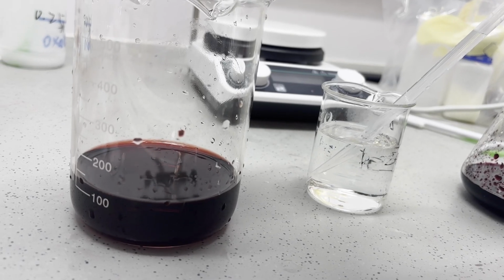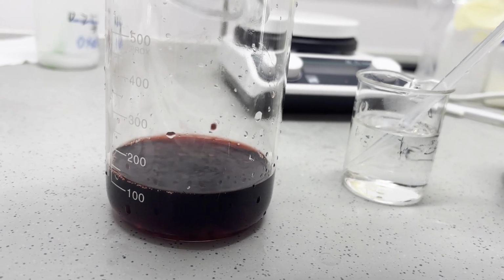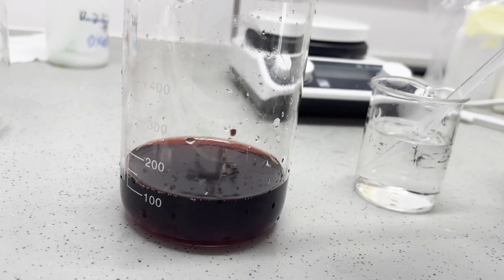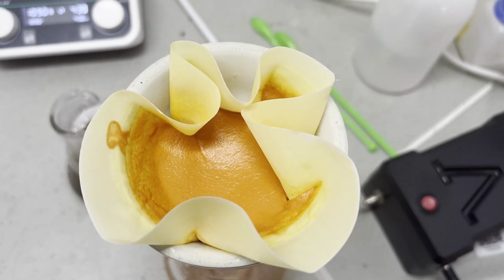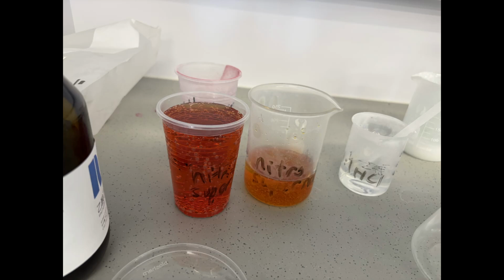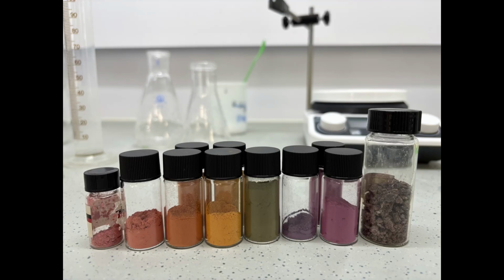To make the nitro complex, I simply added 12.5 grams of sodium nitrite instead of 10, and didn't add the hydrochloric acid. A yellow precipitate of the nitro complex appeared, and I filtered it off. The 2 complexes have a visible color difference, as the nitrito is more orange while the nitro is yellow. However, the nitrito complex transforms to the more stable nitro complex on standing, which caused some interesting results in the spectroscopy later. Now I have samples of all the complexes.